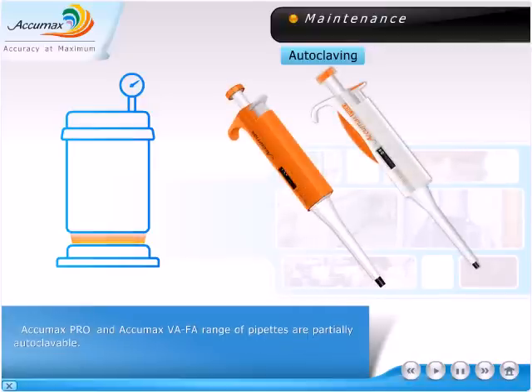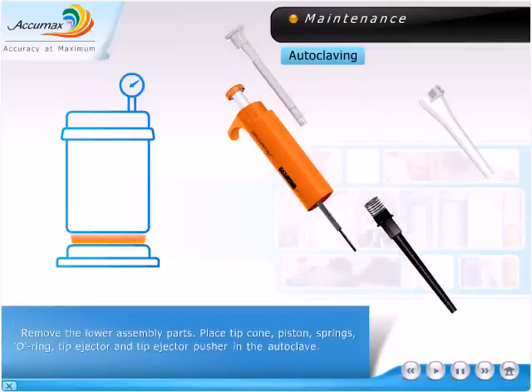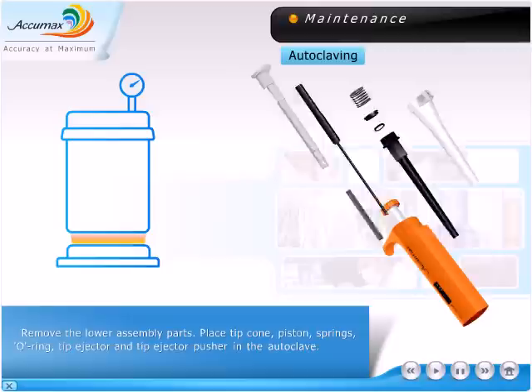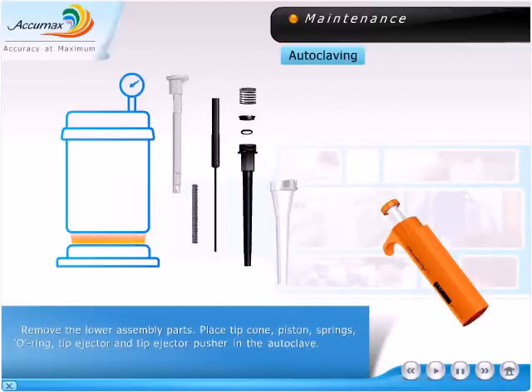AccuMax Pro and AccuMax VAFA range of pipettes are partially autoclavable. Remove the lower assembly parts. Place the tip cone, piston, springs, o-ring, tip ejector, and tip ejector pusher into the autoclave.